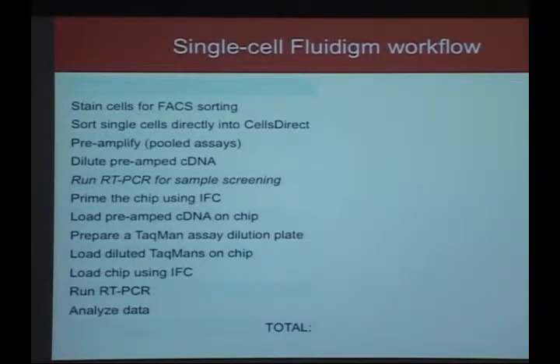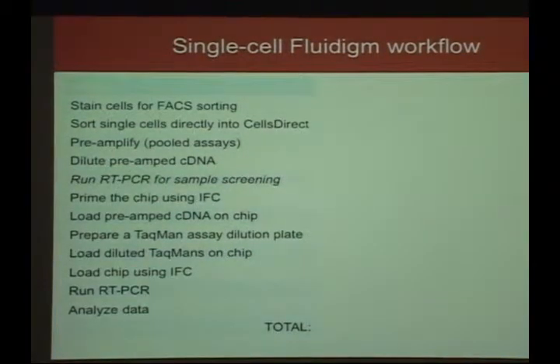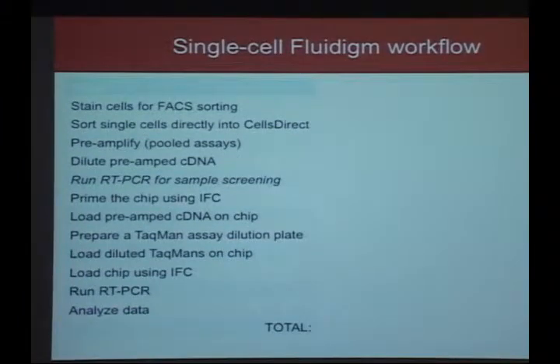Here's a question. When you're making the assay dilution plates, do you make a big 96-well plate master mix and then go from that, where you can store it later on, so you're not having to make up the dilutions every time? Because there are differences between assays if you're setting up one assay versus another, from your pipetting. Yeah, it's not a bad idea, especially if you're going to do the same panel multiple times. I would think that would be the way to do it. Is it stable? The probe, and maybe the master mix. I'd have to ask G about that, how long he can create such a mix and have it be stable.